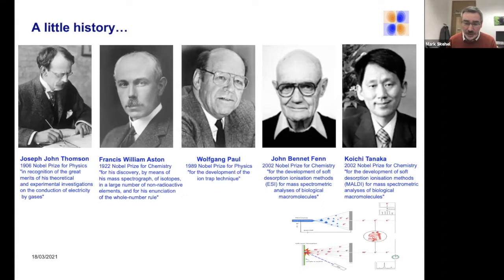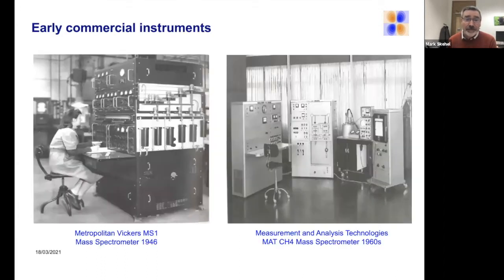All these guys were working not only on instrumentation, but on methods of looking into the physical processes of how proteins and peptides fragment and how you can measure them. So there's a huge body of people who've done an incredible amount of work to get us where we are today. So here are some of the first mass spectrometers.